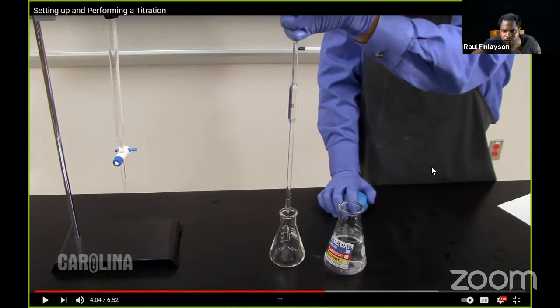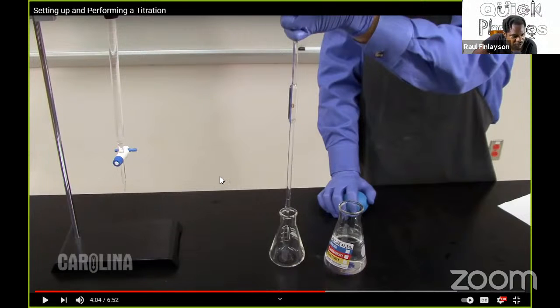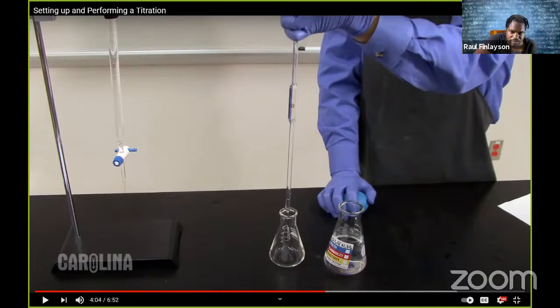Add the pipette to the flask. All right, you see all of them steps, you can watch this video. The link for this video is in the lab sheet, so you can go on the lab sheet and click on it, and it will carry you to this video that I'm showing you. Once you have the steps, you can summarize the steps you see in here. Then you'll have most of the method for the lab.